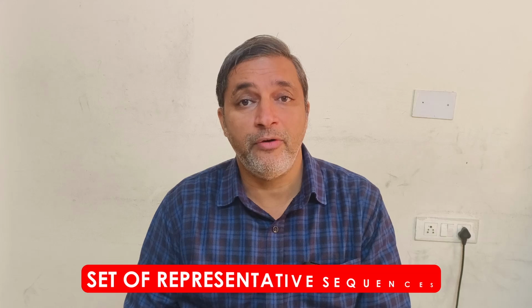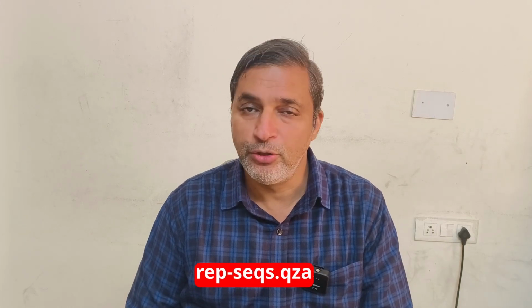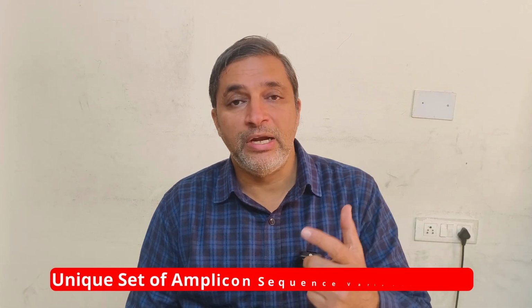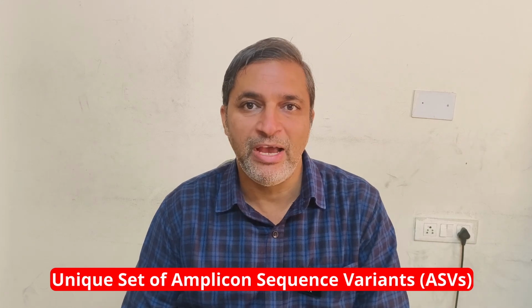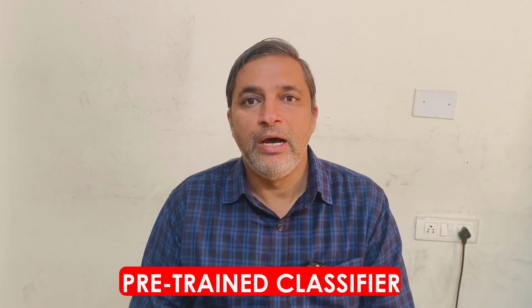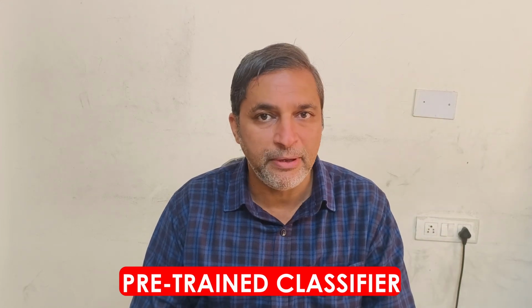For taxonomic classification in QIIME2, we require two important things. First is a set of representative sequences, which are in the form of a rep-seqs.qza file. This file contains numerous sequences, which contain a unique set of ASVs, or amplicon sequence variants. In addition to this file, we also require a reference database classifier. For the help of students and researchers, QIIME2 provides pre-trained classifiers which have already been matched against various hypervariable regions of 16S ribosomal RNA.